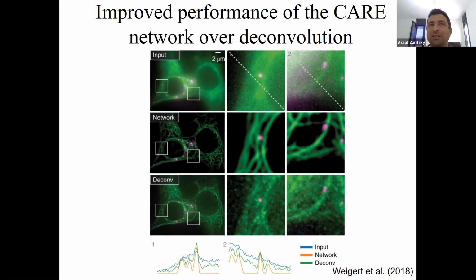And the data-driven approach says, I don't know anything about the system. I don't know how these images are generated, but these networks are really powerful tools at mapping, right? At finding relations. So it's actually mining the data and finds the relations within the data to reconstruct it accurately. It's actually surprising because the deconvolution seems to be more accurate per a specific, let's say, microscope or environment.